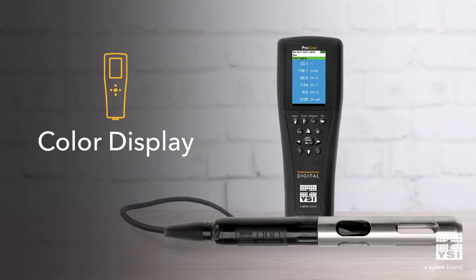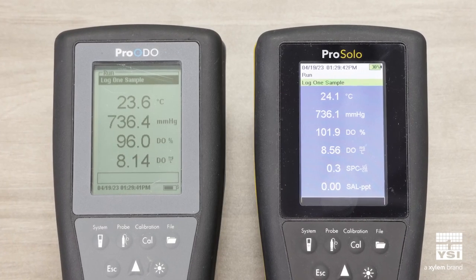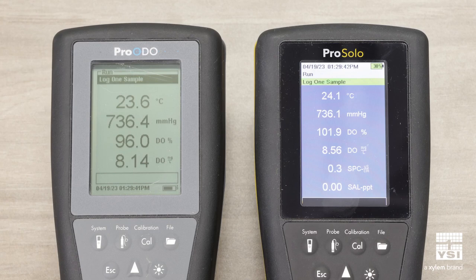With the ProSolo, we've upgraded to a color display that has additional features, like giving you the ability to graph data, visualize stability during calibration, and add photos of your field sites.